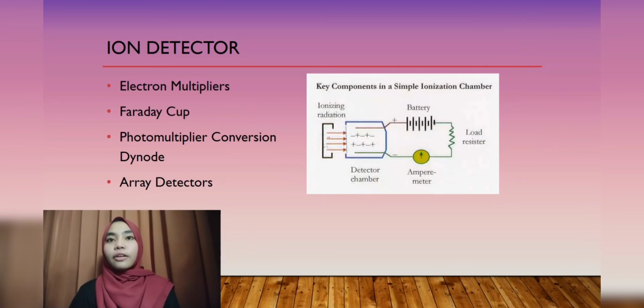There are many kinds of ion detectors that are involved in secondary ion mass spectroscopy. For example, electron multipliers, known as a serial connection of discrete metal plates called dynodes, amplify a current of ions by a factor of 10 to the power of 8 into a measurable current of electrons. The Faraday cup has the ability to measure higher ion currents where the electron multiplier struggles, since it consists of a hollow conducting electrode connected to ground through a high resistance.